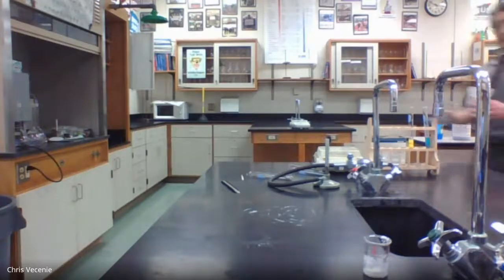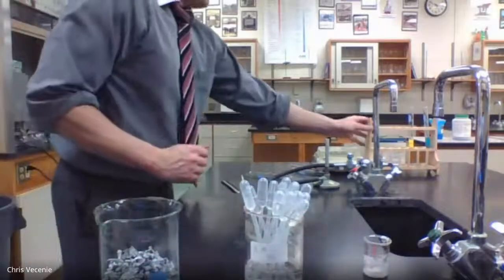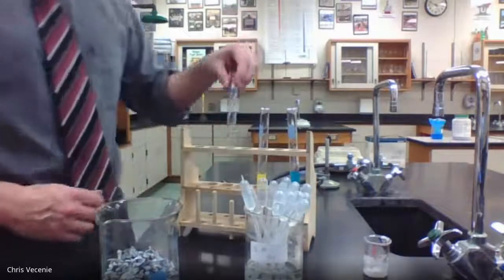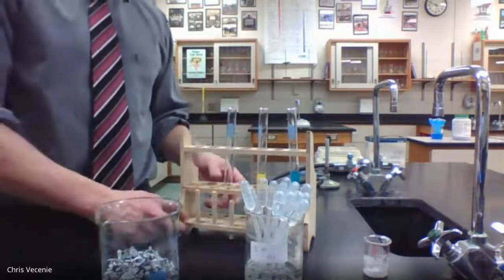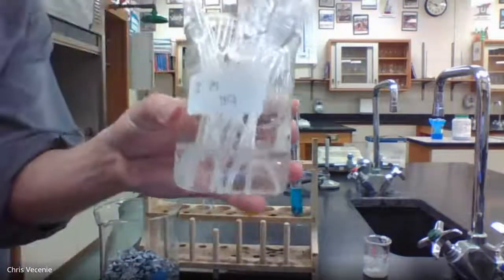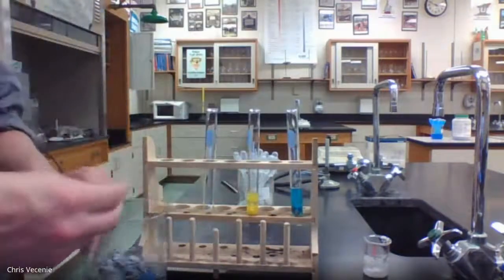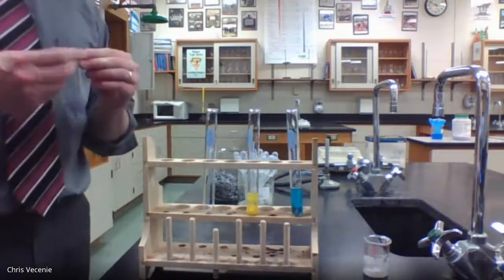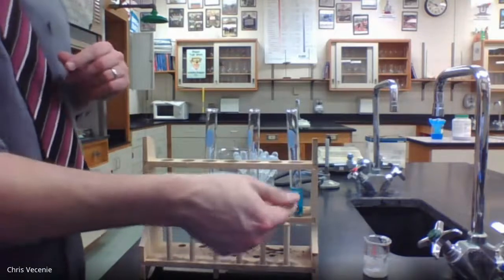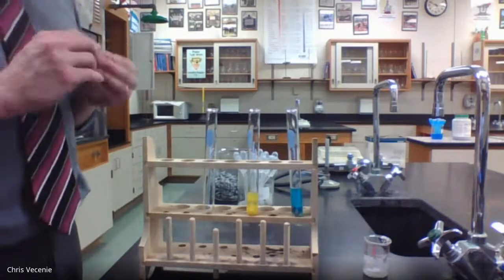So bring over my materials for experiment 5. Bring back my test tube rack. Grab myself a new test tube. What we're doing in this experiment is we're taking hydrochloric acid and reacting it with another piece of that zinc, to see what happens if we put the acid with the metal. Over here, I took the metal and put it with a compound, copper(II) sulfate. What is it going to do if we put it with an acid?